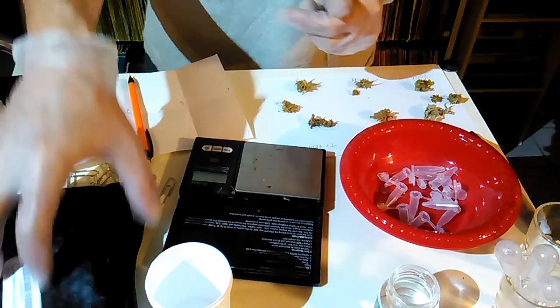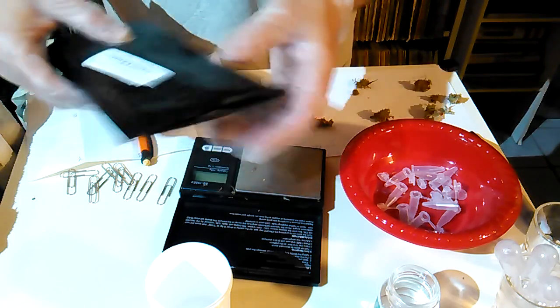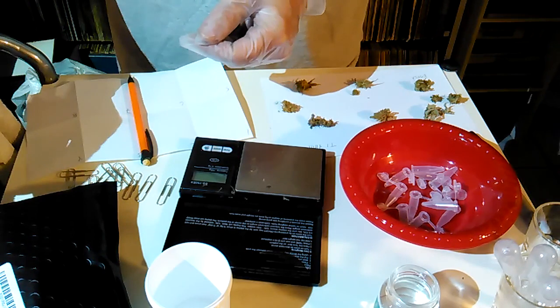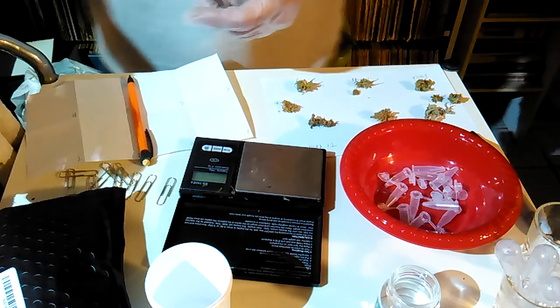And then potash, which is potassium hydroxide, KOH. This is a 4-ounce pack I got off Amazon. You can get it by the bucket for pretty cheap, but this will last me for hundreds of samples, so I just get a small pack.